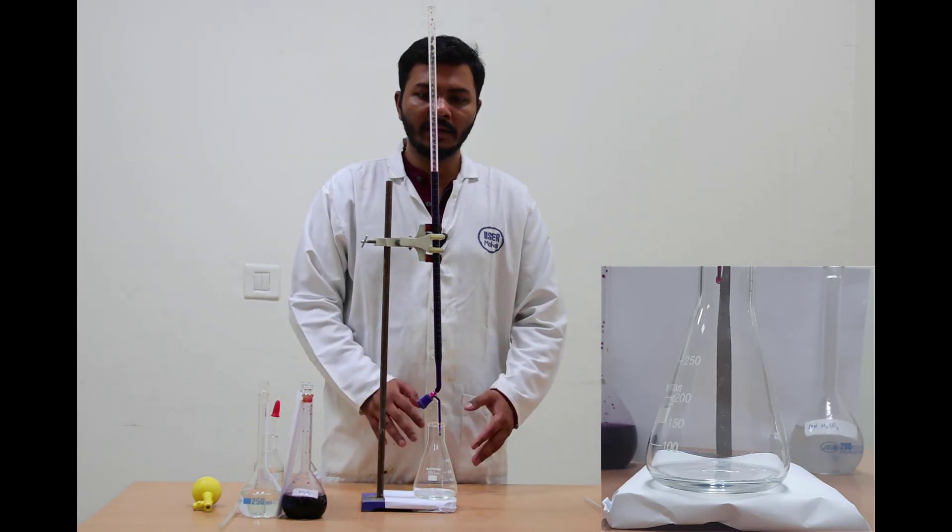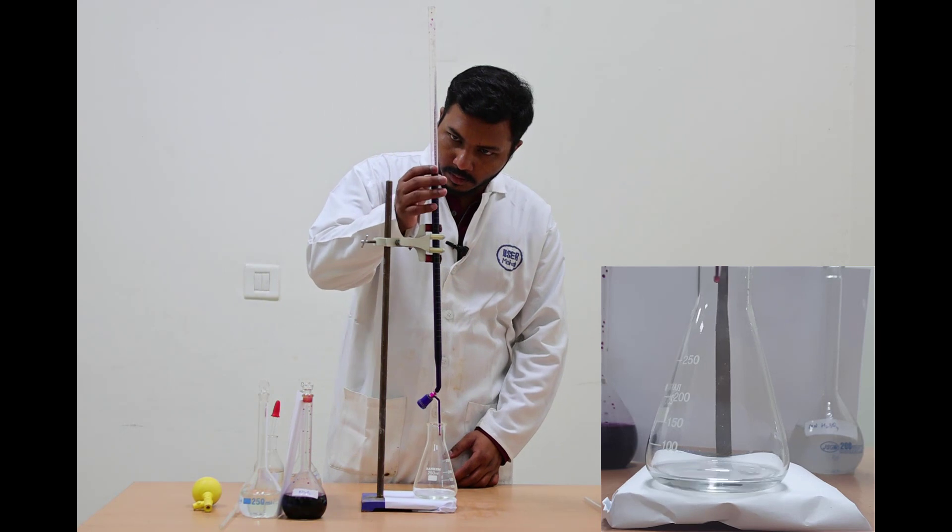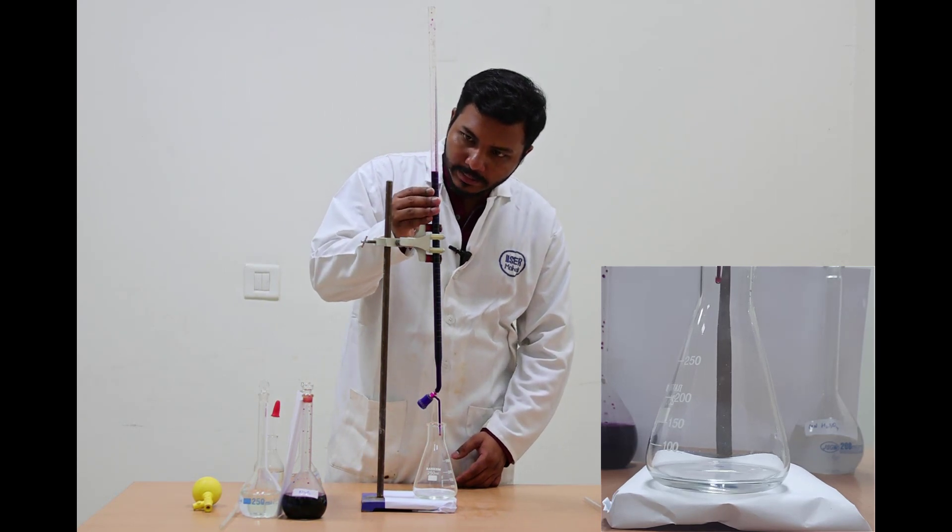Now I am performing the titration a third time. The initial burette reading is 19.8.